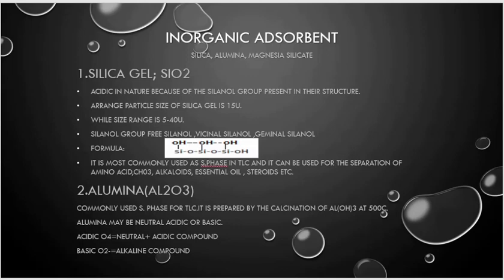It is the most commonly used stationary phase in TLC, and it can be used for the separation of amino acids, alcohols, alkaloids, essential oils, steroids, etc.